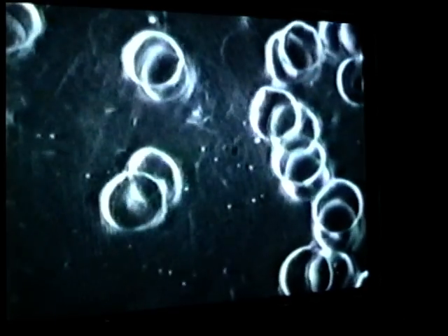Here's a couple more real sleepy white blood cells. They're just really not very active. And he was very fatigued, he said, too. He just didn't feel like himself. This man is 46 years old, and he had a lot of complaints, and you can see some of the red blood cells are hypochromatic, and some of them have parasites inside the red blood cells. When we did the parasite frequencies on this man, those parasites really started moving to the rhythm of the light whenever we were doing the parasite frequencies on this slide.